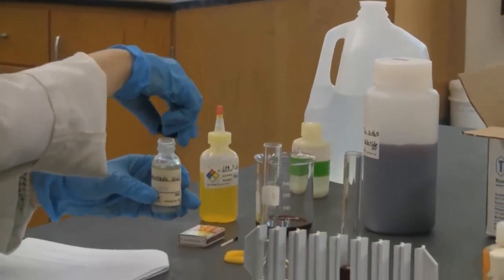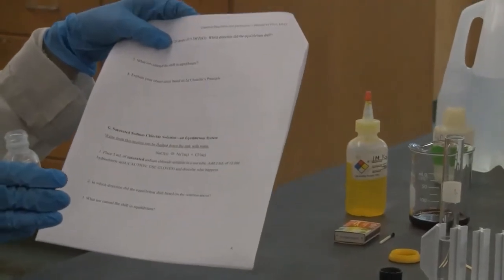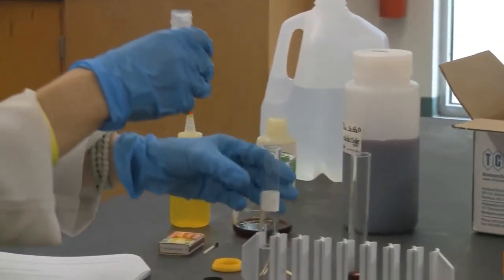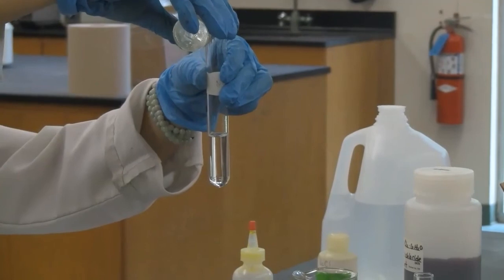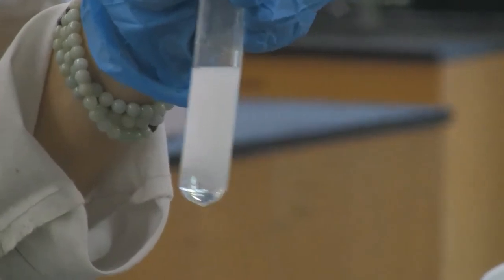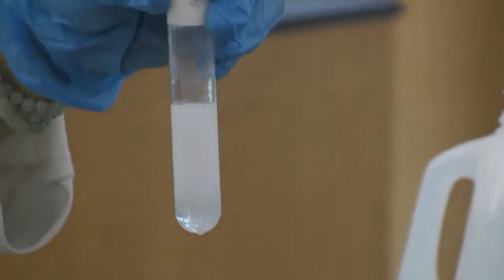Okay, you can see the chloride is part of the equilibrium. So hydrochloric acid will introduce some ions into the system. Check closely. See what's happening. Okay, then check which direction the equilibrium shifts and why.